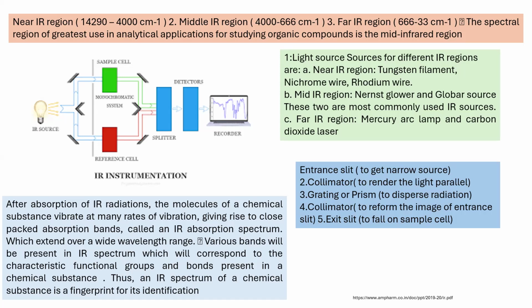Mind well, again I'm insisting that lambda max is a concept we have learned. Here, for specific functional groups, you may hit a particular wavelength. We will take an example in the next slides. But generally, because it is a complete molecule, you will get an IR absorption spectrum, a wide range of wavelengths that is going to be absorbed.